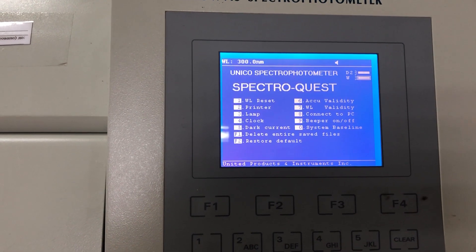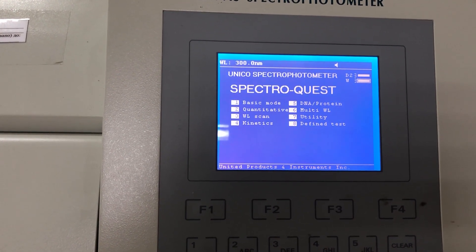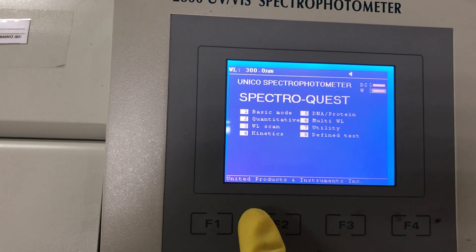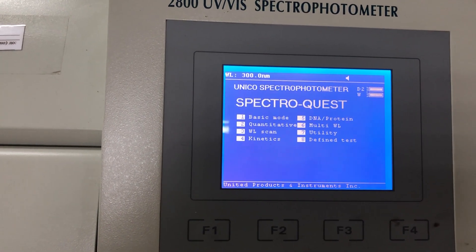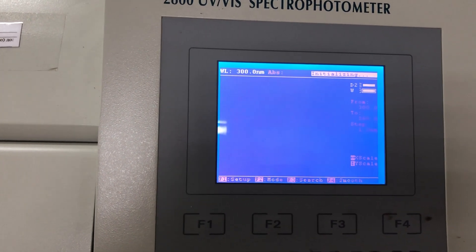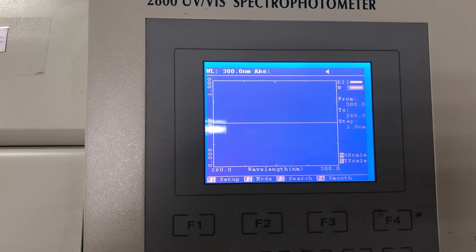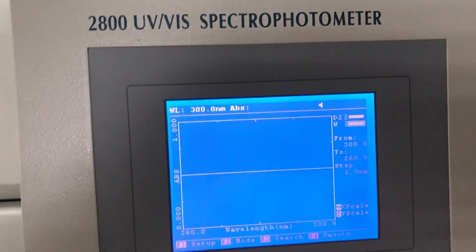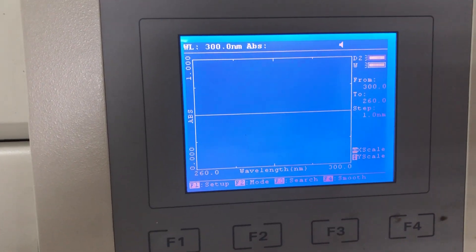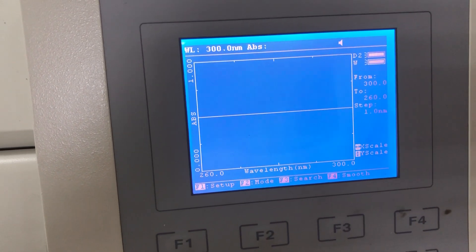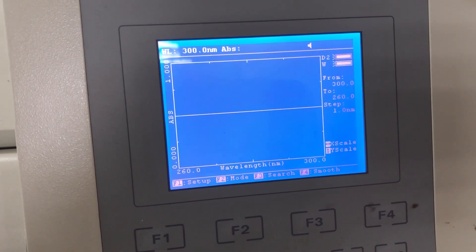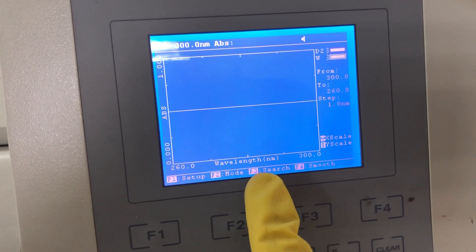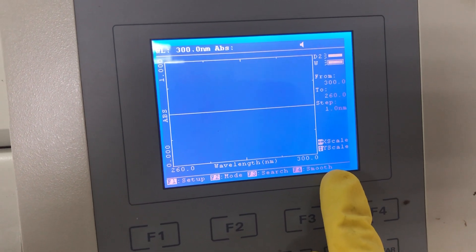Once again, you can go to wavelength number three, scan. This is the normal window. Here we have four options: Setup, Mode, Search, and Smooth.